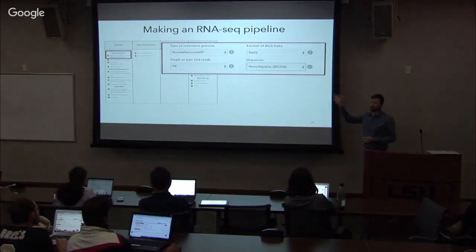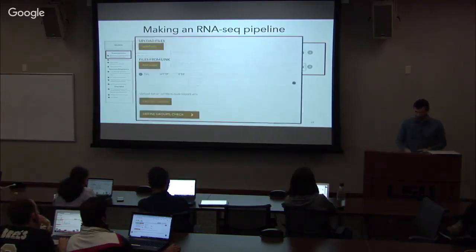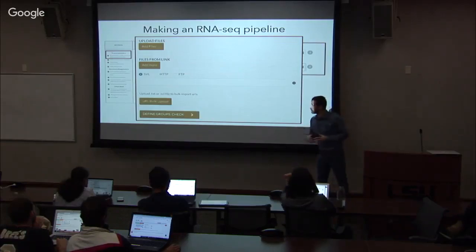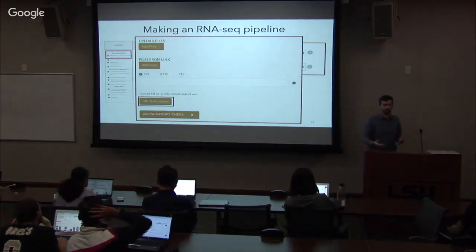And we will input FASTQ files that are paired-end. Paired-end means that the read is being read from both sides, and so we end up having two files for each sample. And then we will merge them. As you select that on top, and I will do this all with you in just a second, you will want to select URL bulk upload right there. And that is where you upload that SVL file.